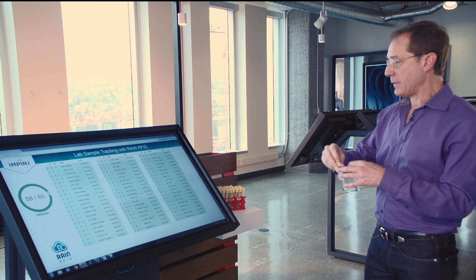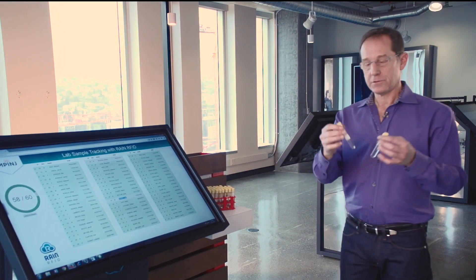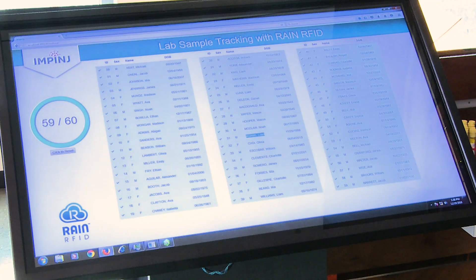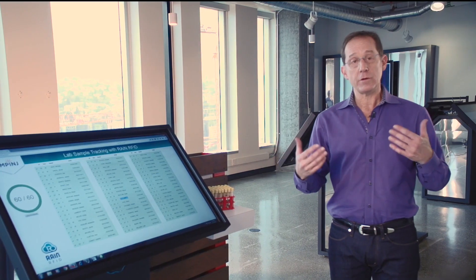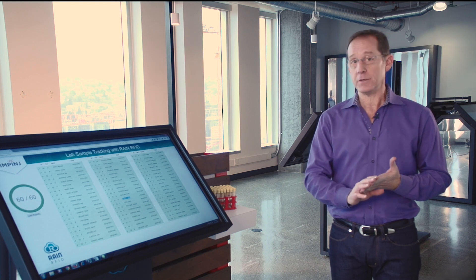And you'll see in a minute as I pop them back in - this Liam Adams and William Acosta - those samples now will go back into the rack, and right away we now know those samples have been returned to the test table. So just showing you here that we can tag large numbers of very small items that are very valuable and need to be tracked.